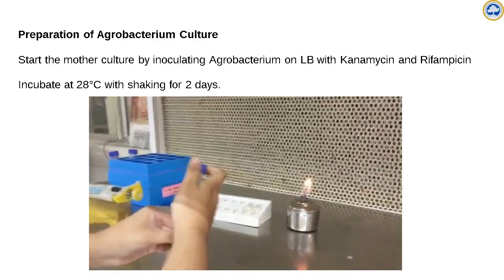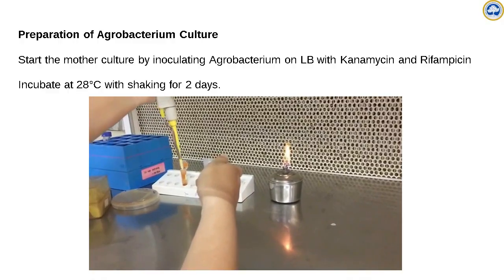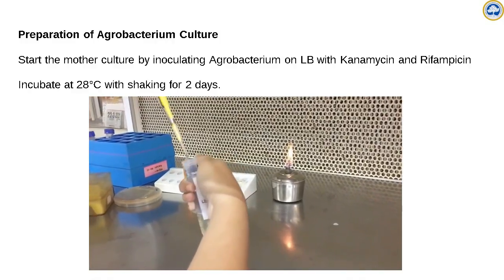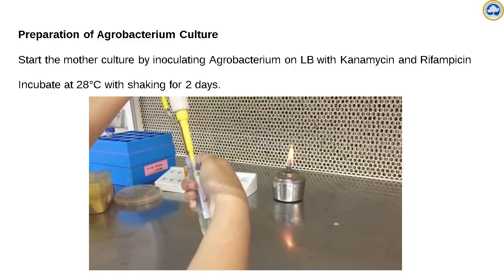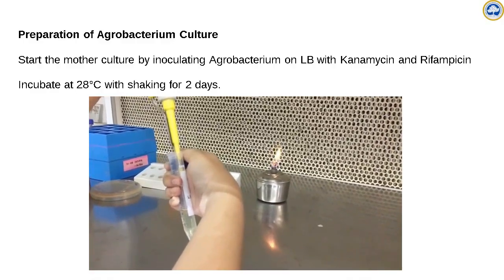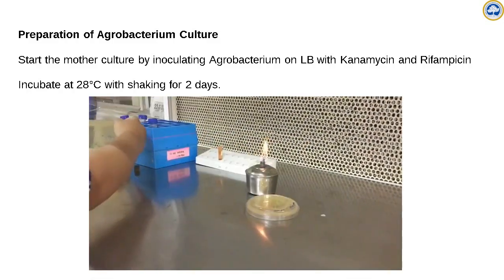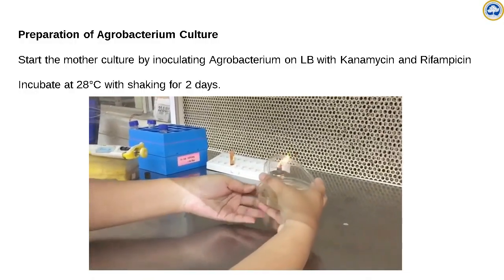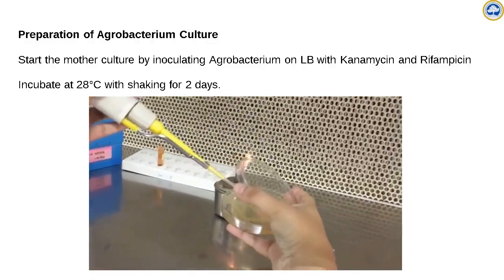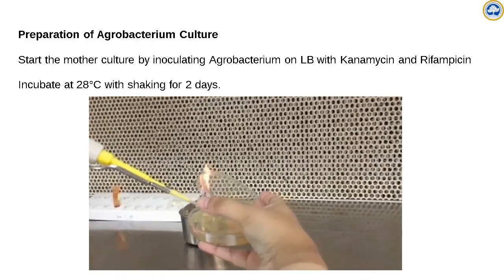So the first step in this particular agrobacterium transformation of onion epidermal cells is the preparation of agrobacterium culture. So from a single colony, we try to inoculate or prepare a mother culture. We take a single colony from the agrobacterium, which is harboring the GFP protein fused to the gene of interest or the promoter under investigation, and inoculate it in a 5 ml LB broth. The broth is pre-inoculated with kanamycin selection as well as rifampicin selection. Kanamycin selection is 50 microgram per ml and rifampicin selection is 10 microgram per ml.